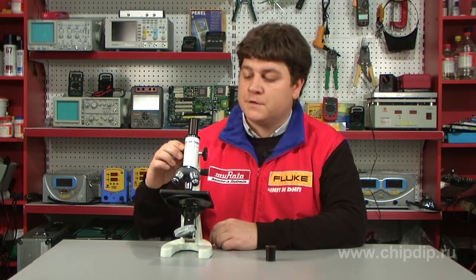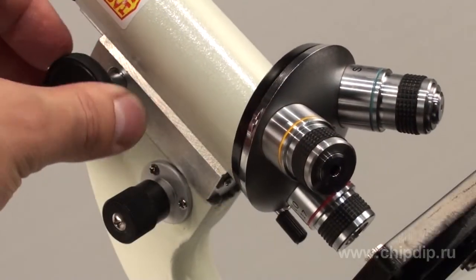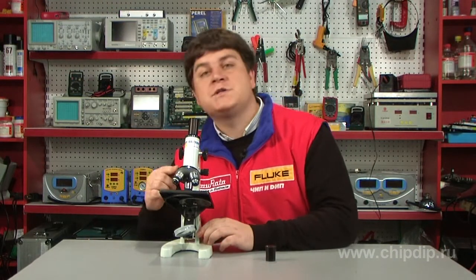Using the hand wheel, lower the sighting telescope as close to the sample as possible, just a few millimeters away. Then focus the device with the help of the micrometer screw.